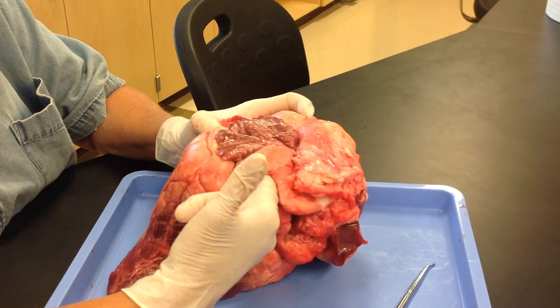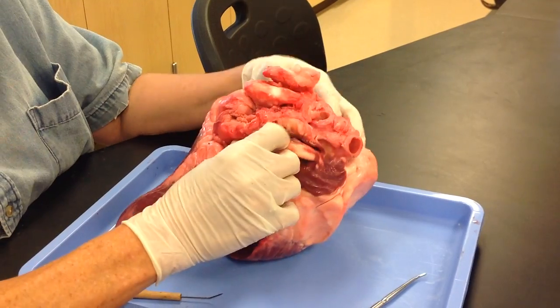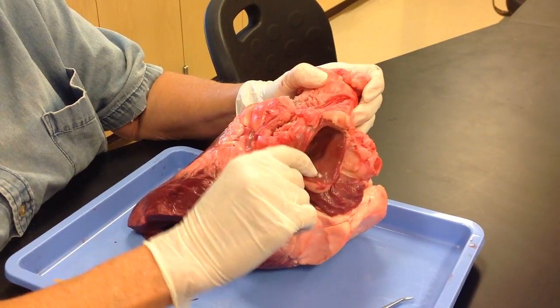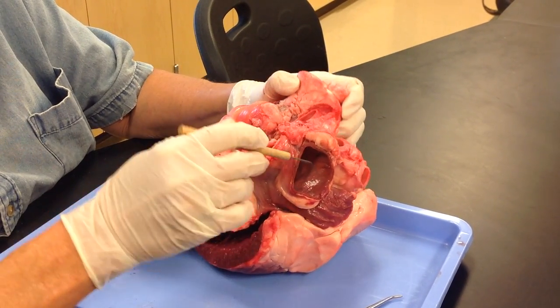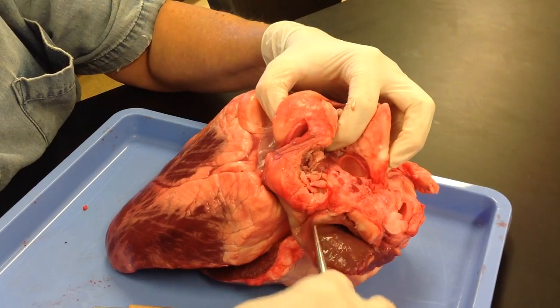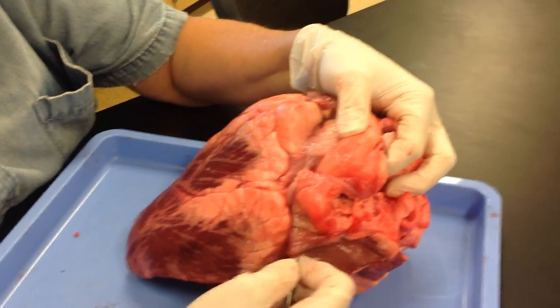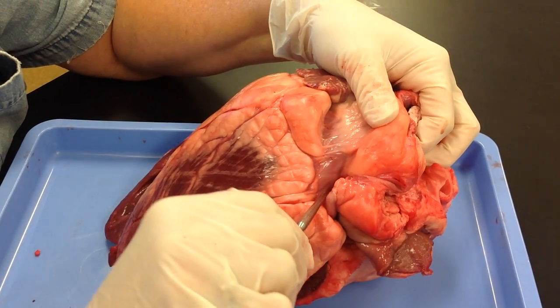Left side is oxygenated blood. On the right side, with the right atria, you have three structures that go into the right atria. You have your superior vena cava, your inferior vena cava, and the third thing that dumps deoxygenated blood into your right atrium is this structure here, which is your coronary sinus.